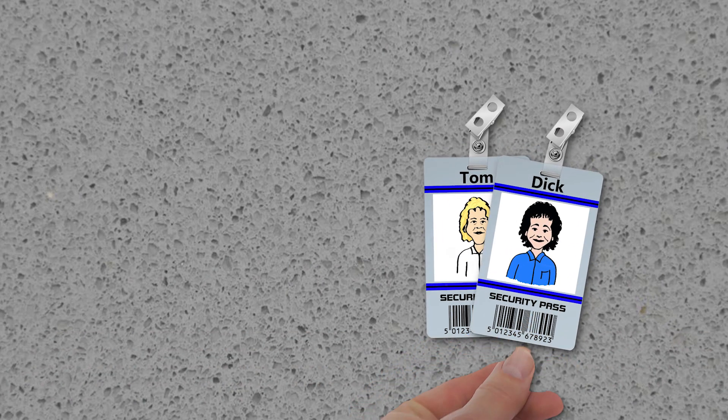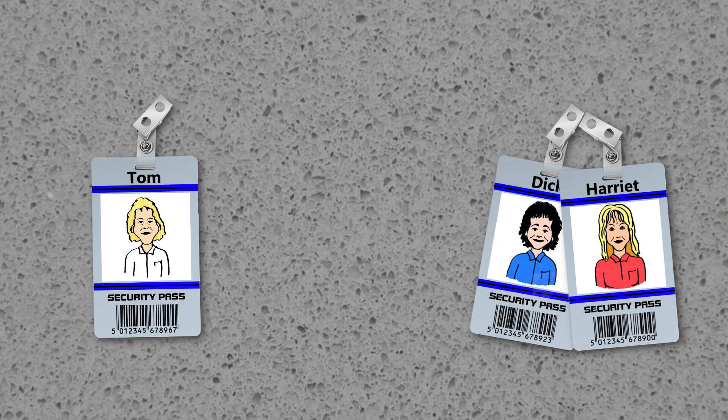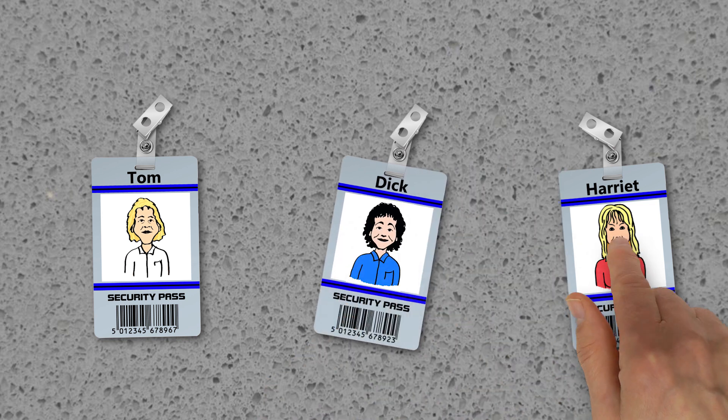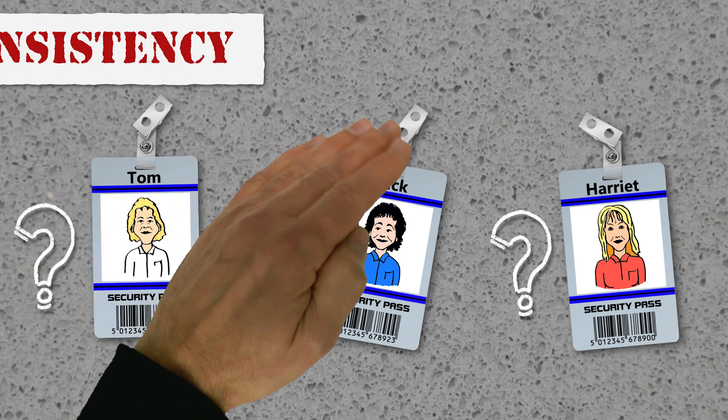To show what we mean, let's look at Tom, Dick and Harriet when they test pellet durability. When Tom does it, he doesn't always sieve the pellets correctly. When Dick tests, he doesn't always weigh out the right amount. And when Harriet tests, she can be a little careless when emptying the test chamber, leaving behind tested pellets. All these factors can affect the recorded test results.